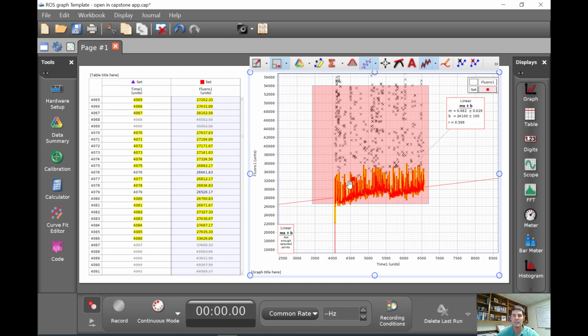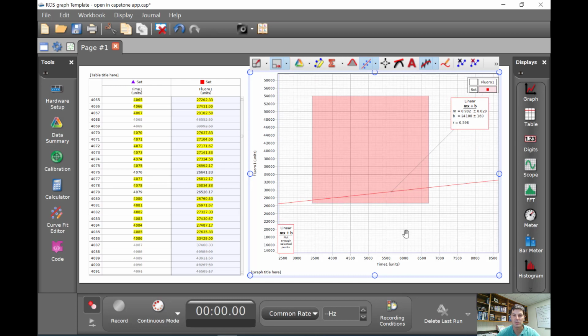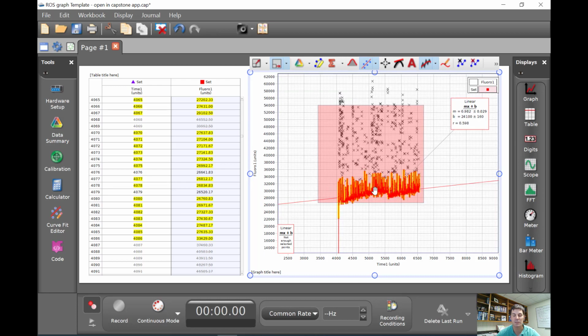One of the things that will entail is zooming in or zooming out. You can do it a couple of ways. Here we can just zoom in using our keyboard or mouse. Obviously you can't see this, but on my mouse I'm just using my wheel to spin out.